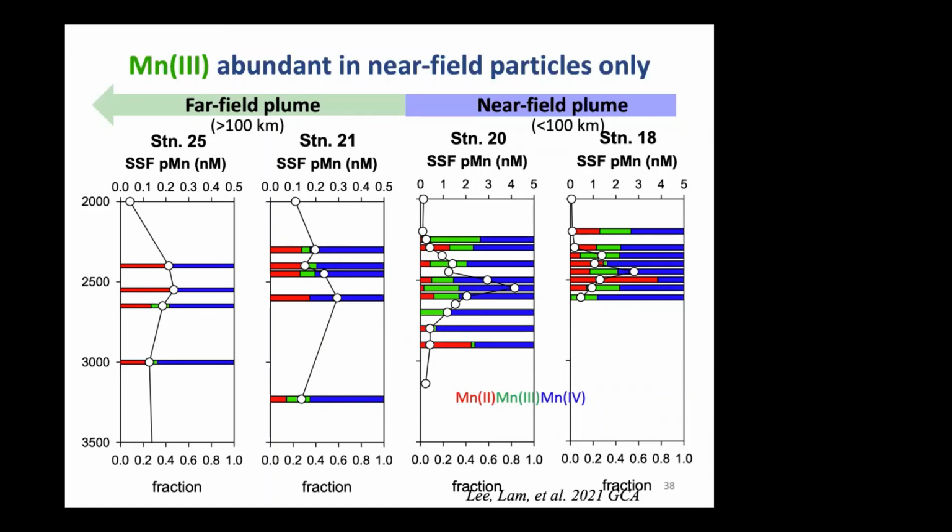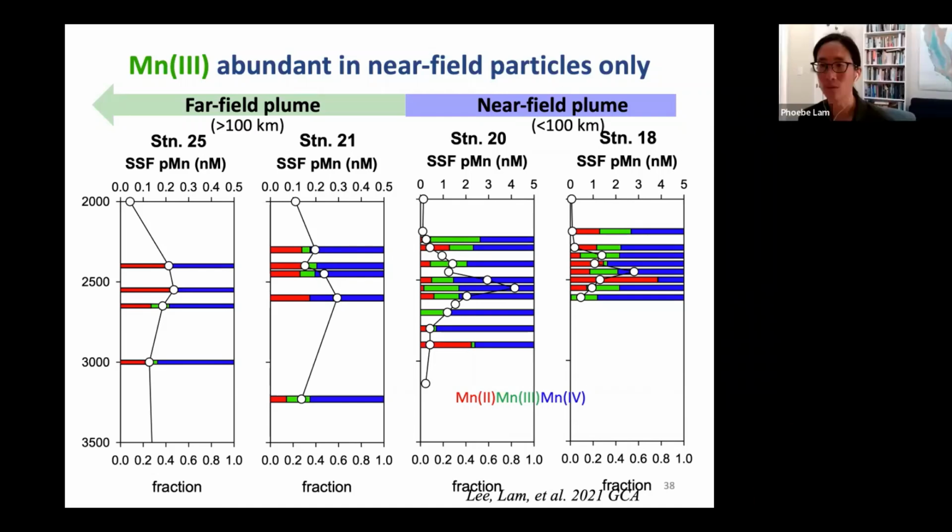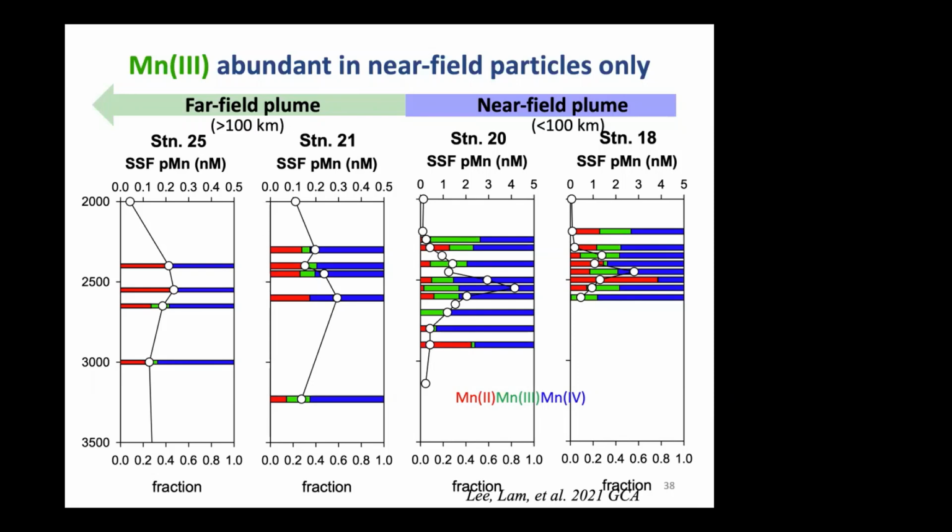And it's not manganese 2 sorbed to manganese oxides? No, because we had that as a standard, and we made all sorts of sorption standards, and it didn't look like any of our sorption standards. Cool. A mystery.